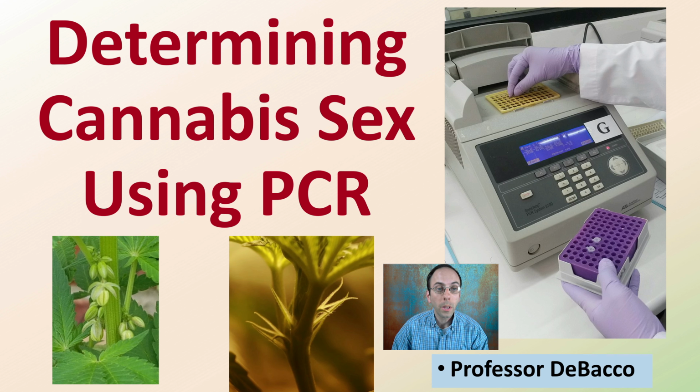We're looking at determining cannabis sex using the PCR method, which is advantageous because you can tell whether a plant is male or female well before it actually flowers. So we'll go over some of the methods and some of the background of this polymerase chain reaction method, or PCR.